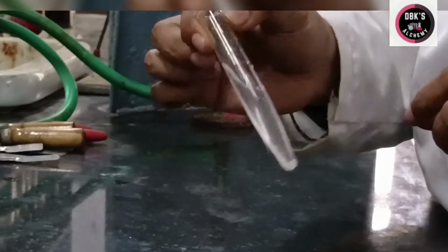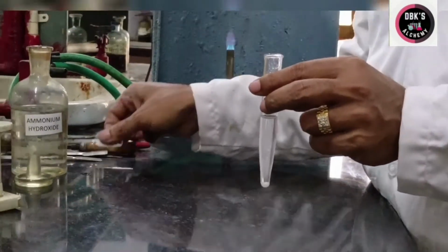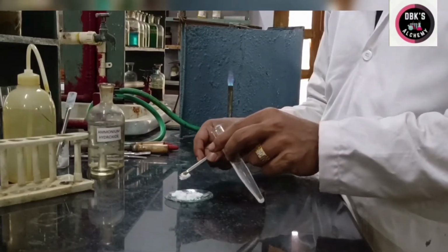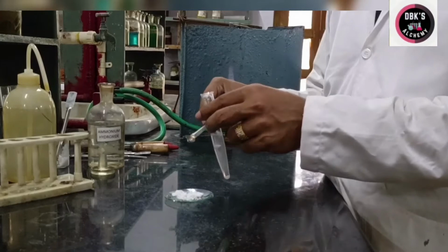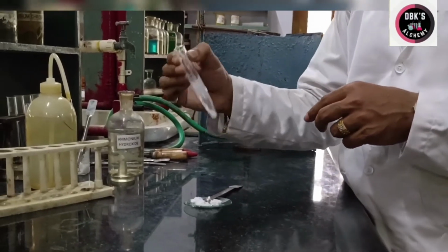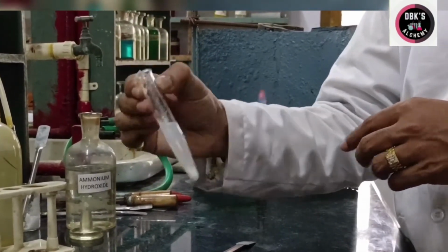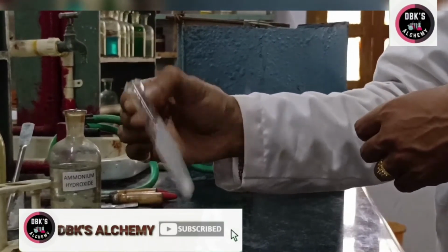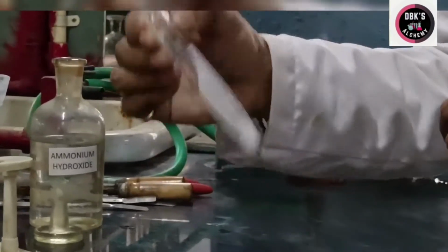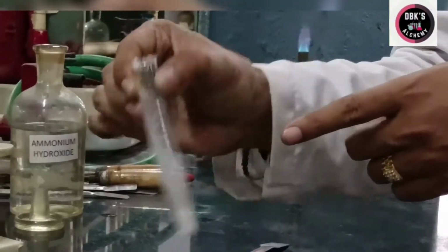Now I have to add a pinch of ammonium carbonate. I am adding a pinch of ammonium carbonate. Okay, and we'll see whether we are getting any precipitate or not. You see the beauty? We got a beautiful precipitate. So the formation of this precipitate indicates that there is fifth group cations present.